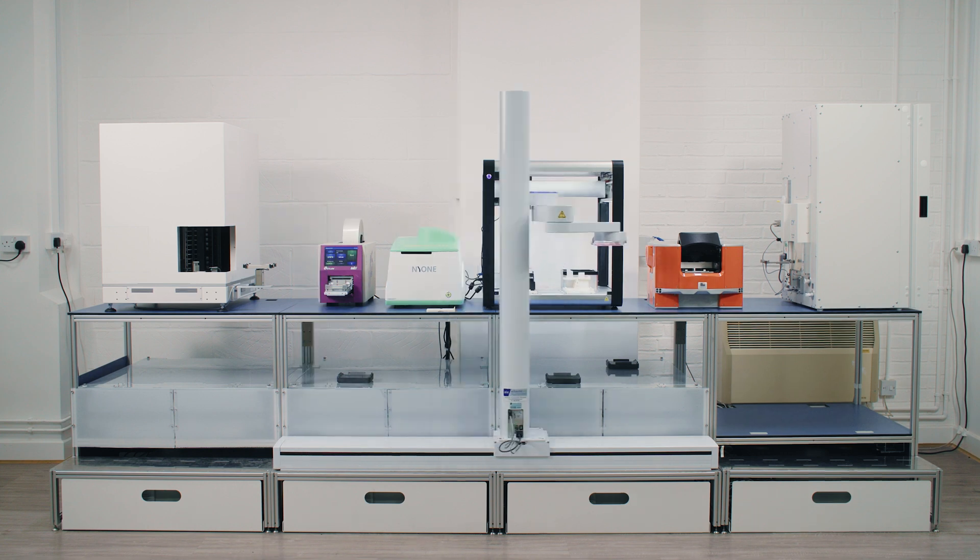The main challenge of doing these workflows manually is that scientists have to do a lot of repeated tasks and have to come over the weekend. There are a lot of manual touch points from taking a microplate from the incubator to the liquid handler and then back to the incubator.